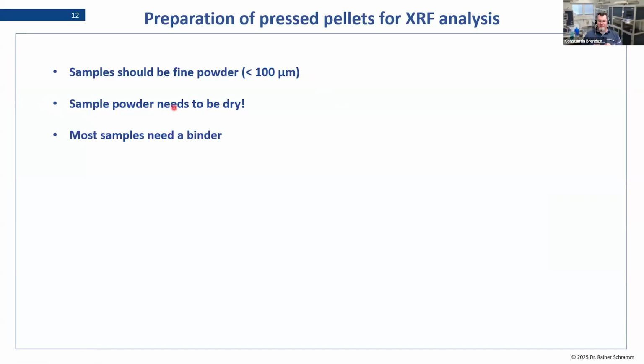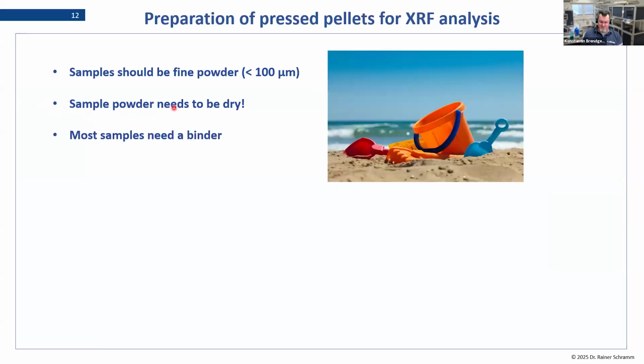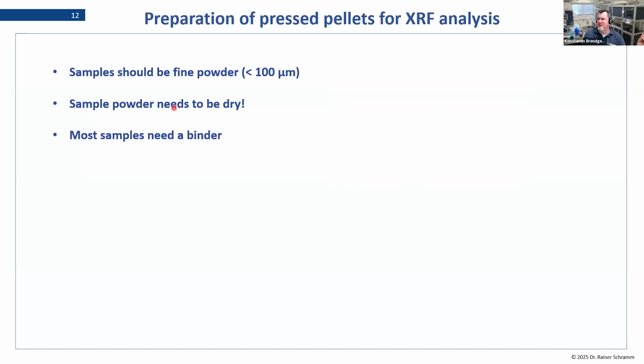Our laboratory is quite lucky in that regard. We usually receive our analyzer samples in a little bag or a little container, which has already been milled, dried, and kind of prepared for analyzers, prepared for preparation, so to say. But if you are looking at industrial laboratories, or laboratories working on site with the industry, they get samples from outside, from the dumpage, from the containers, from a transport, or maybe from a conveyor belt. So it's quite different. Those samples can be exposed to the elements.